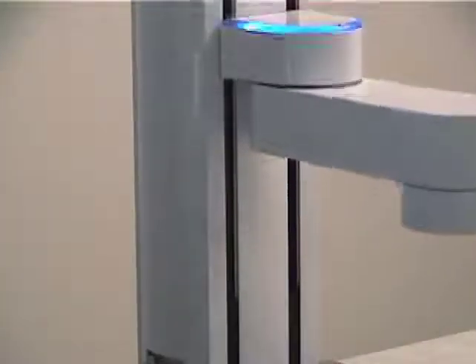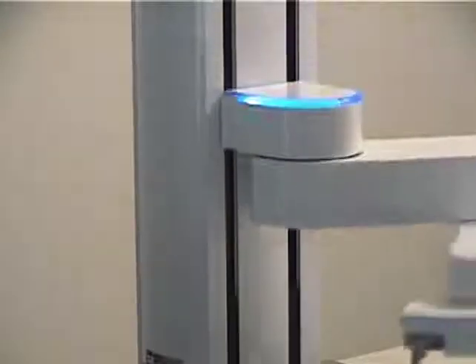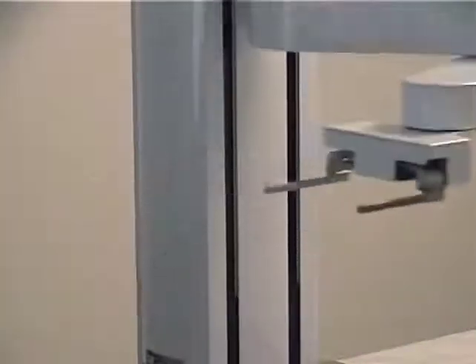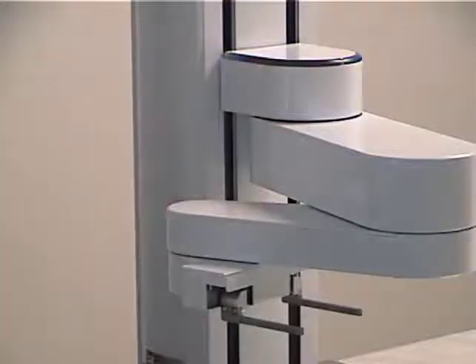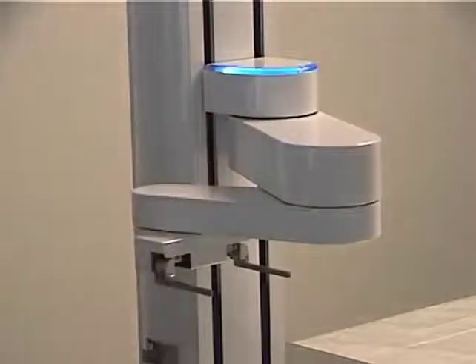What makes this robot unique are the features that make it a collaborative robot. Collaborative robots are mechanisms that can be used without safety shields due to their intrinsic safety features. All the forces generated by the PF400 are limited so that the robot cannot hurt a user even if it collides with them at full speed, making it safe to operate side-by-side with personnel even without safety shields.